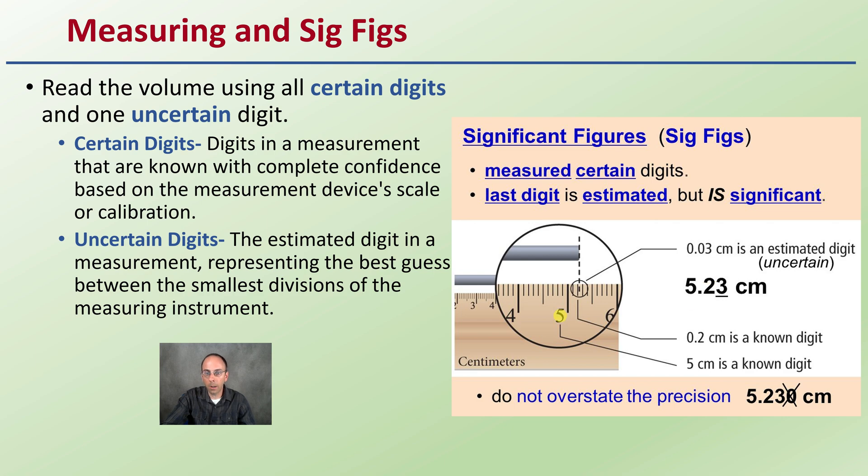We can see here — it's 5.2, and then the uncertain digit would be that 3, because we look exactly at where that is and it looks like about three tenths between there and there. The 0.2 is known because we can see it's just beyond that mark, so we know the 2 is certain. Some people might say 5.22, others 5.23 — and that's where the uncertainty plays into this as well.